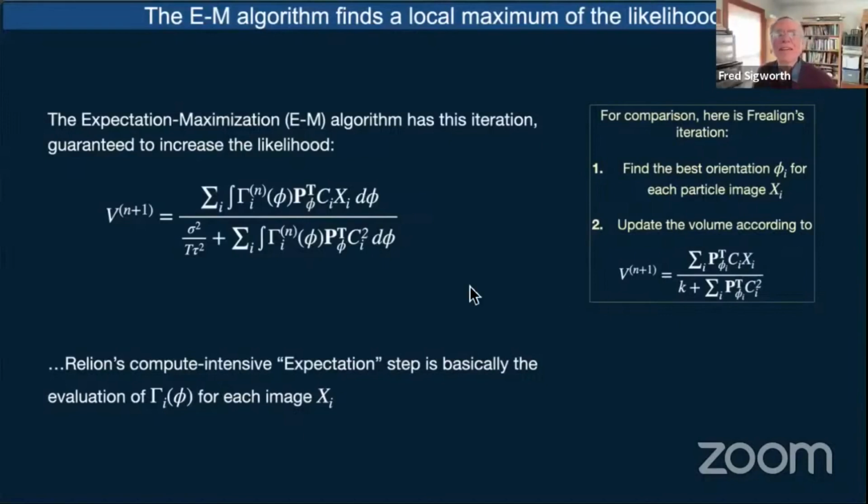Right. Okay, so this is actually the formula that Relion uses, and this is 1 over the signal to noise ratio. Here is the noise, sigma squared, and this tau here is the signal magnitude squared, and then there is this thing that Scheres calls the fudge factor, and this t-value is an artificial inflation of the signal to noise ratio. Now, Scheres doesn't say why he uses it, but it says it works better with t-values of 2 or 4. And I think it's because of the mismatch in the volume or the area taken up by the particle and the box.